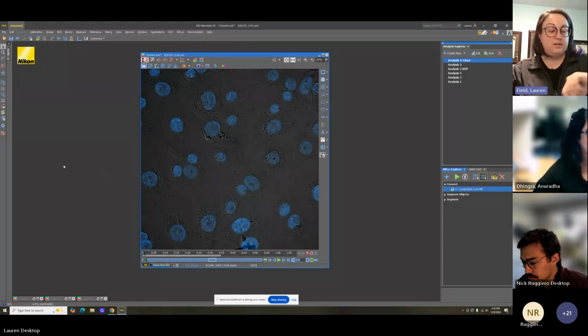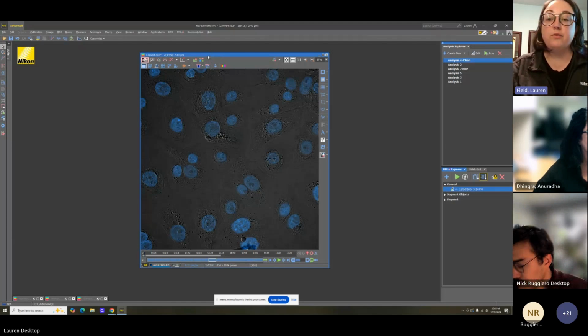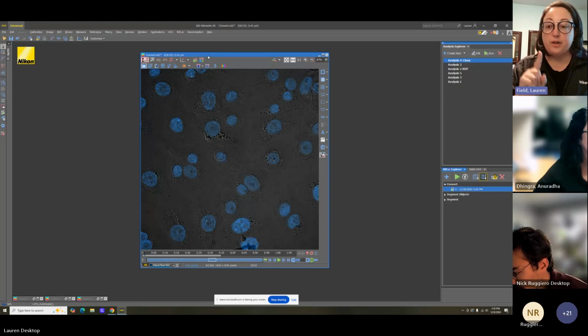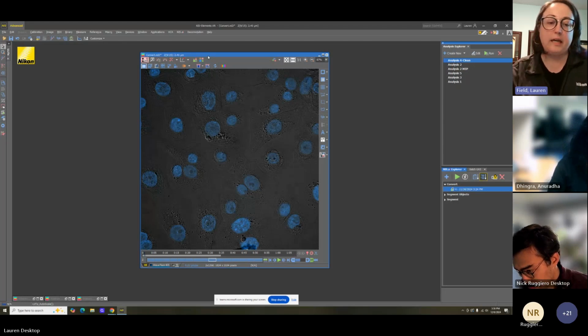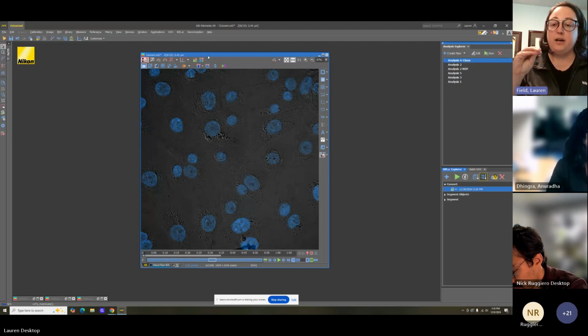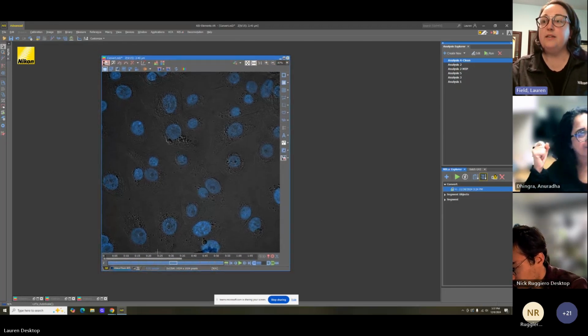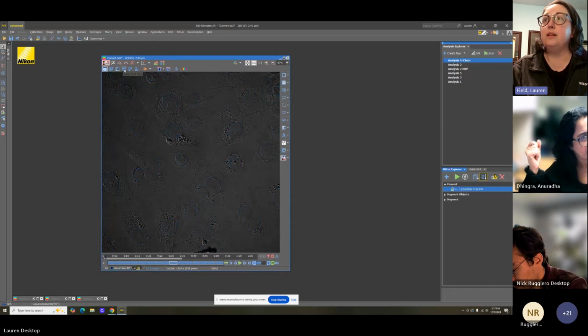We're running a little long, and I unfortunately have a hard stop at 4. So I'm going to go over very specifically, we had a group that was looking to do a convert. So I'm going to go over how you do that and what that output is going to look like. And then I'm going to go into one of the other thresholds that does a little bit of parent-child comparisons. We're going to be looking at that one in 3D, but I also did a max intensity version of that as well.